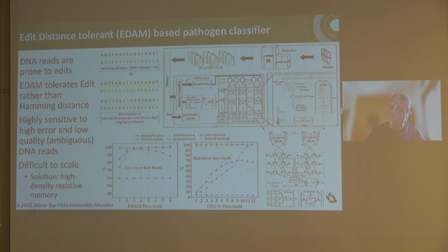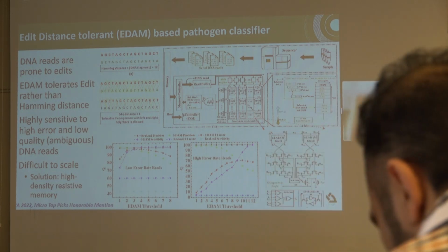Another solution that I would like to briefly cover is called EDAM, which is an edit distance tolerant pathogen classifier.